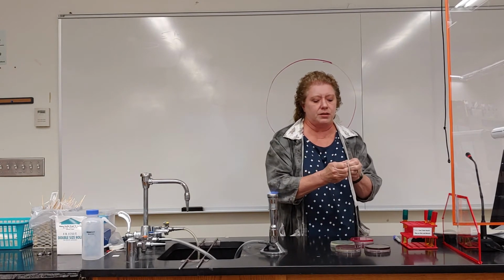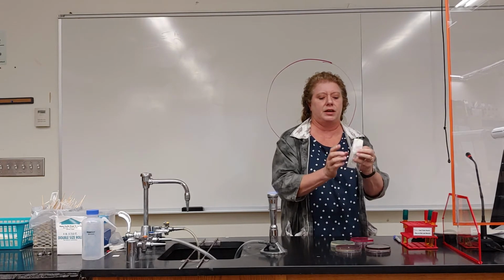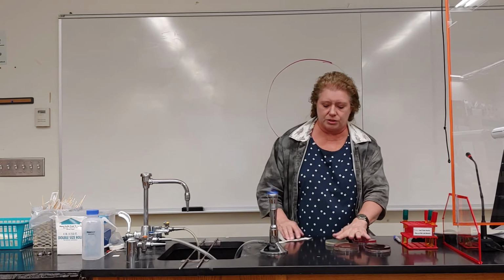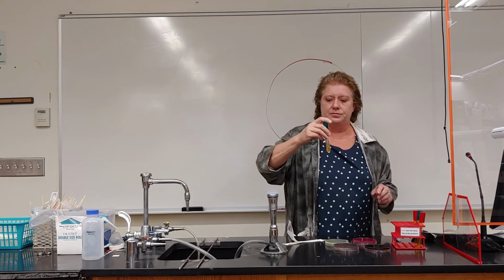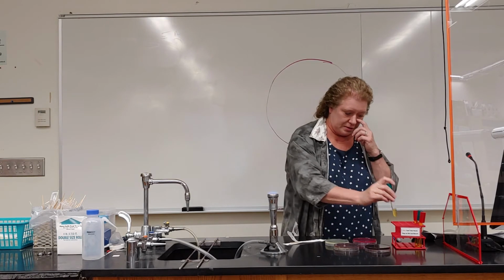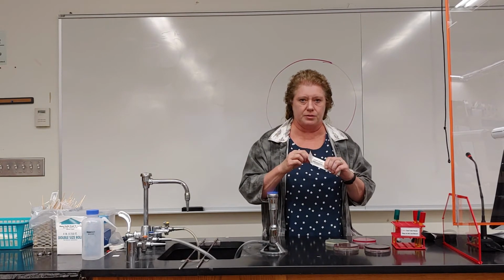Okay, and you can peel this down to get ready, just so you have the stick sticking out. Your swab is still down here, nice and sterile. Okay, you have your plates all ready to go. You have your culture. So you're going to pick it up. Okay, agitate it. Go ahead and get your swab. Okay, pull your swab out.